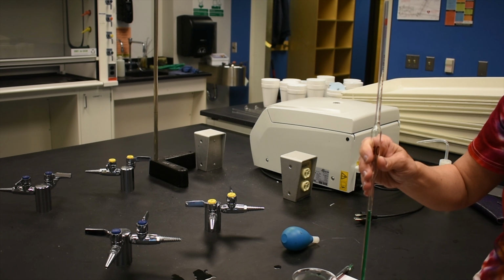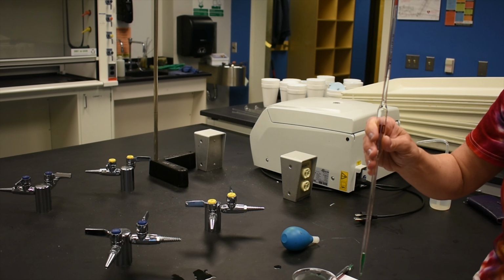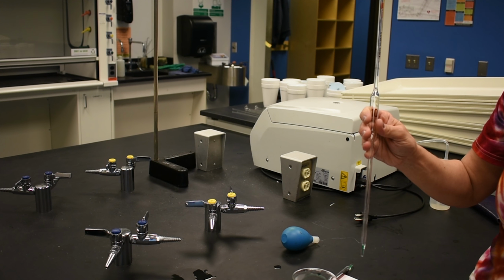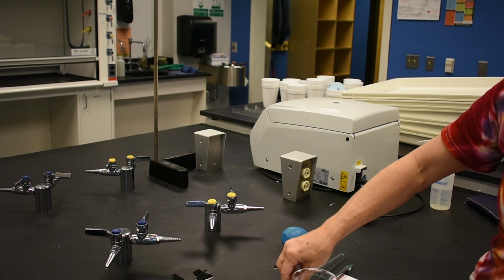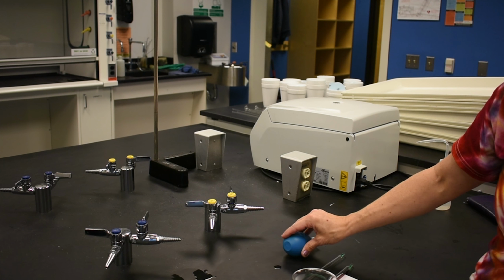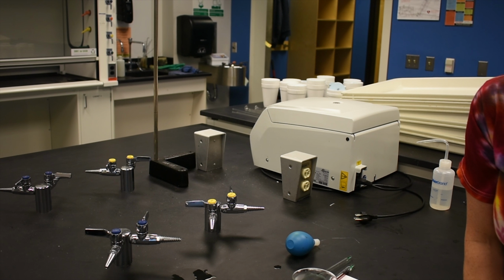And again, once the solution has drained out, you should notice that there's a little bit of solution remaining in the tip of the pipette. This is exactly how it should be. So when the solution has drained to that point, you are finished. You set your pipette down. You will clean everything out, return everything to where you got it, and that will conclude our video about volumetric pipettes.